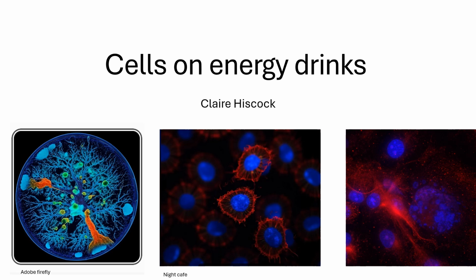Hey everyone, this is a presentation about my project in experimental molecular cell biology, where the goal was to induce cell death by using a random reagent. For my experiment, I added a droplet of energy drink enhancer to a culture of COS7 kidney cells.